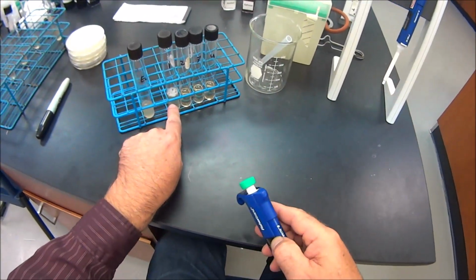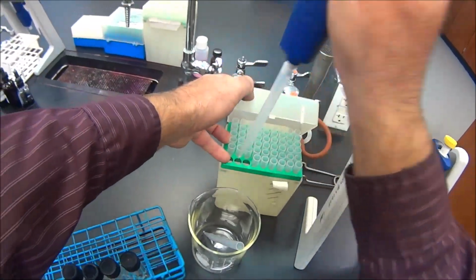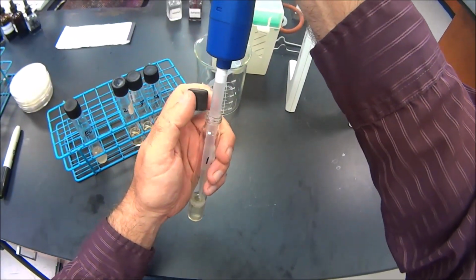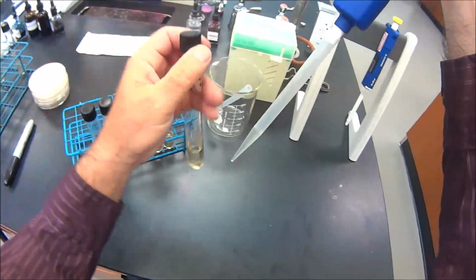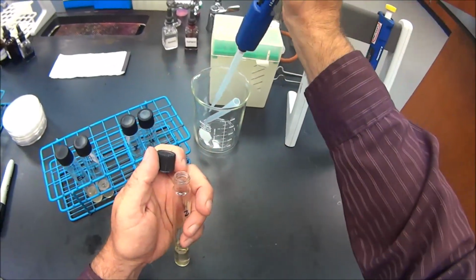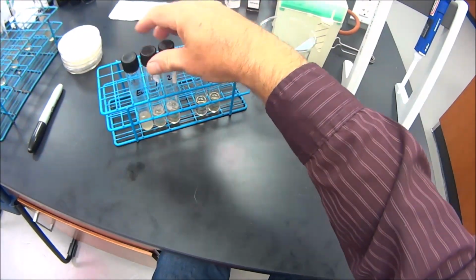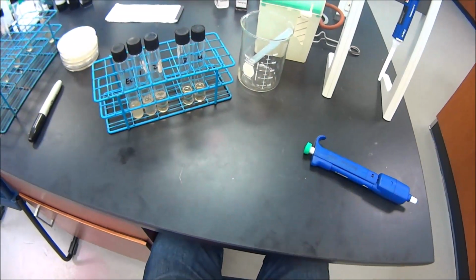Now I'm going to take 1 milliliter from here, put it in the next tube, and this is called a serial dilution. Not like cornflakes, but like a series. So take 1 milliliter, and the resulting dilutions will be factors of 10. So if that was 10 to the minus 1, this is now 10 to the minus 2, which is 1 in 100. Okay, I'm going to repeat that. So 2 goes into 3, mix it up, 3 goes into 4, and I'll be right back.